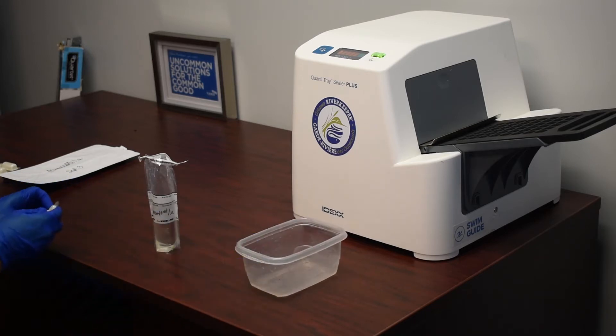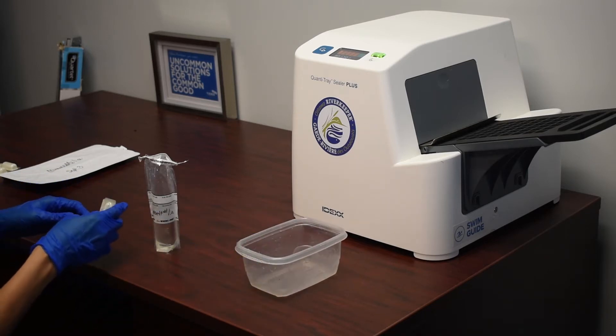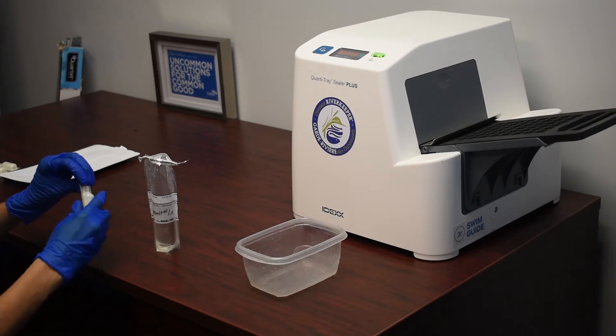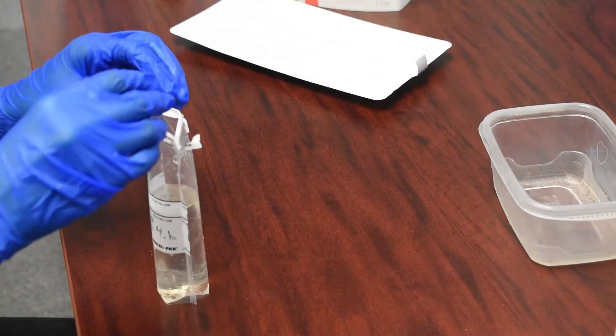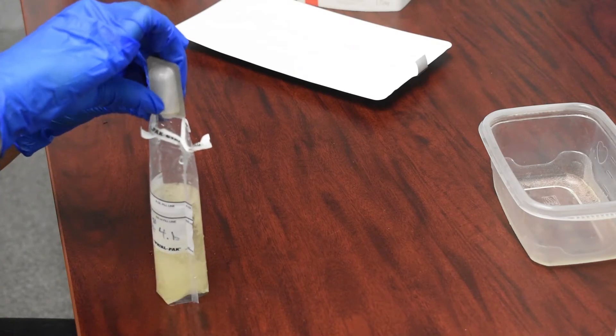Once we have 100 milliliters in the Whirlpack bag, we can then add the ColAlert reagent. We just pop it open and pour it into the Whirlpack.